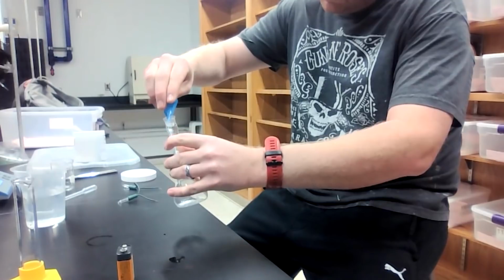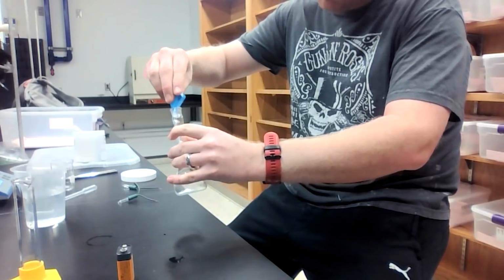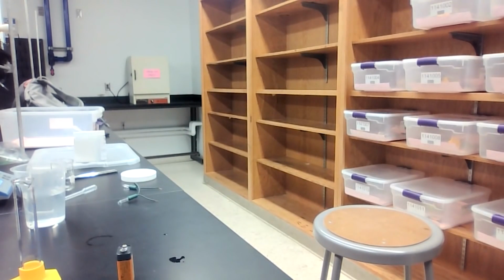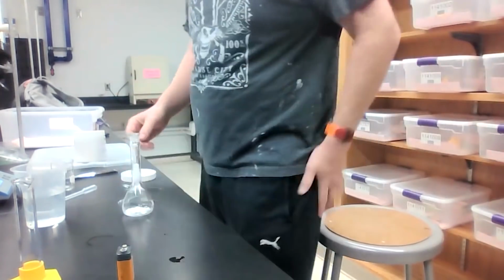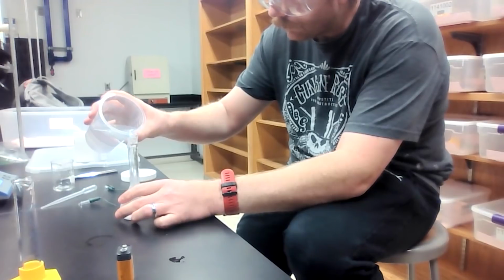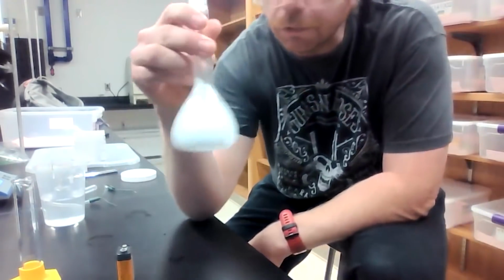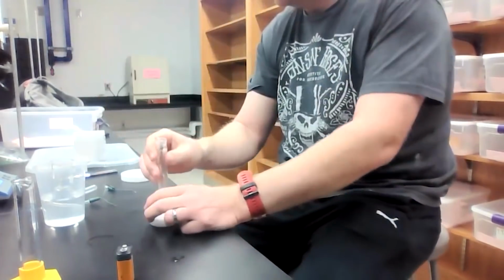If you've ever had to use chalkboard chalk or sidewalk chalk and tried washing it off your hands, it's kind of tricky to deal with. So I've got my chalk, my calcium carbonate, in there. Now what I'm going to do is transfer the deionized water. It's super cloudy. Swirl, swirl, swirl.